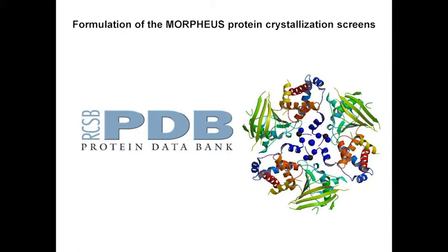These molecules are employed mostly as additives that act as protein stabilizers, crystal packing bridges, or any other roles beneficial to protein crystallization. Each MORPHEUS screen integrates 96 conditions, a minimal format adapted to automation and limited amount of sample. To minimize the number of conditions employed, the molecules found in the PDB are combined into mixes of additives.